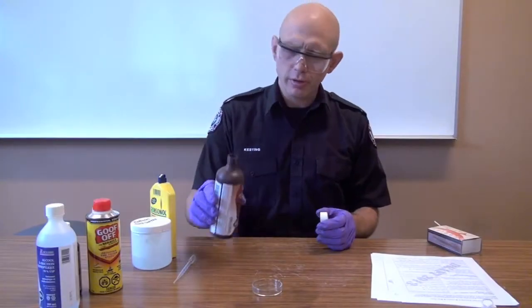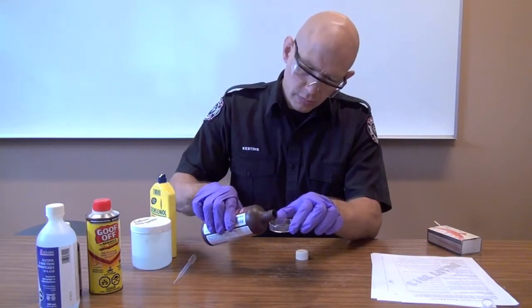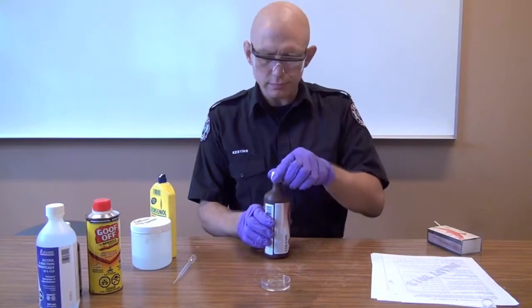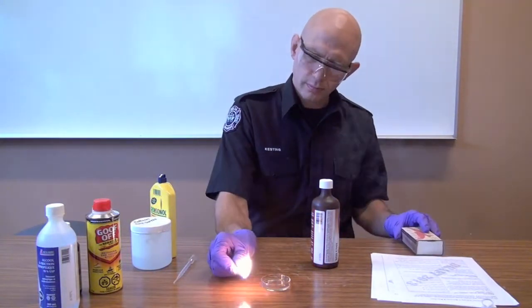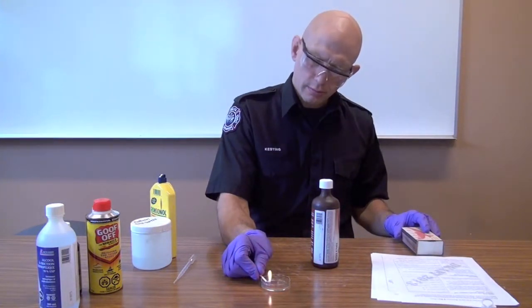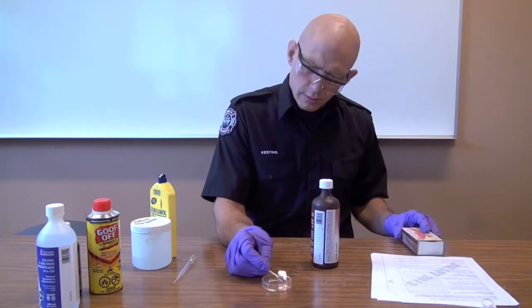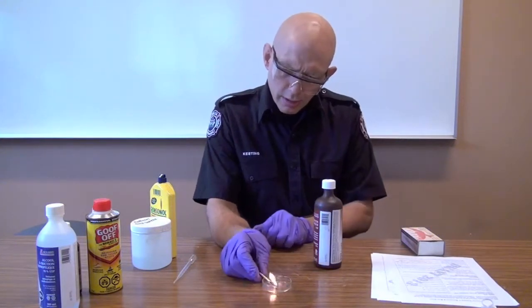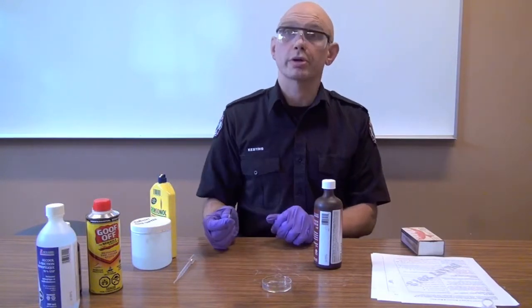Let's play 'Does It Burn?' with hydrogen peroxide — add a small amount. Apparently, hydrogen peroxide does not burn, which is what we would expect.